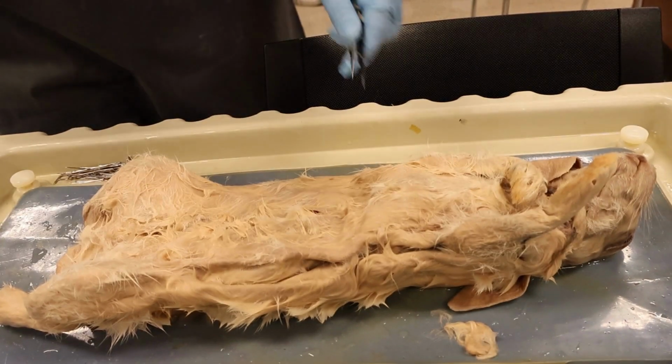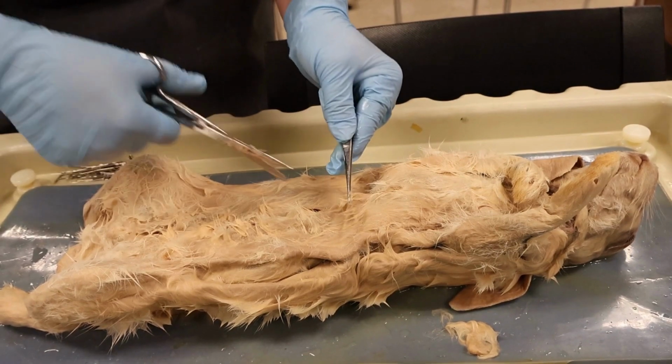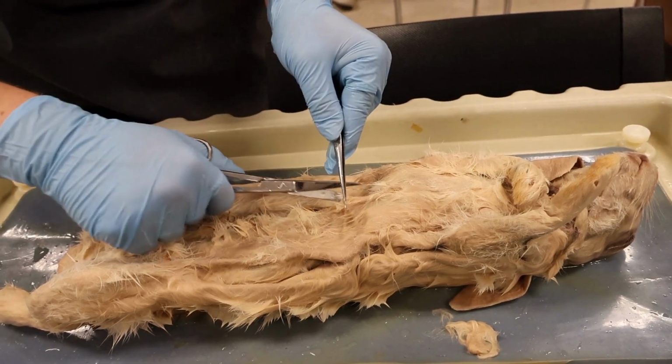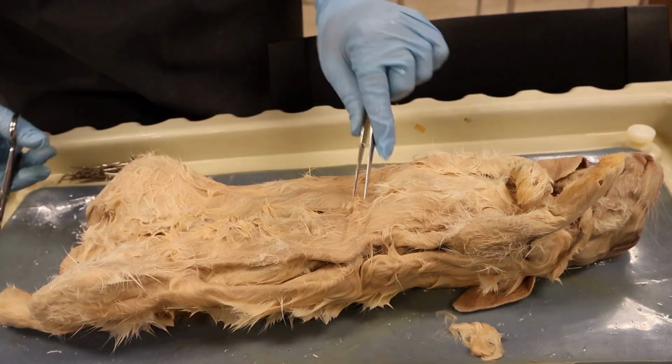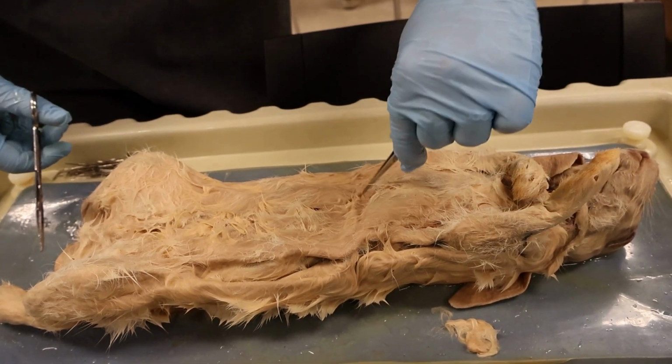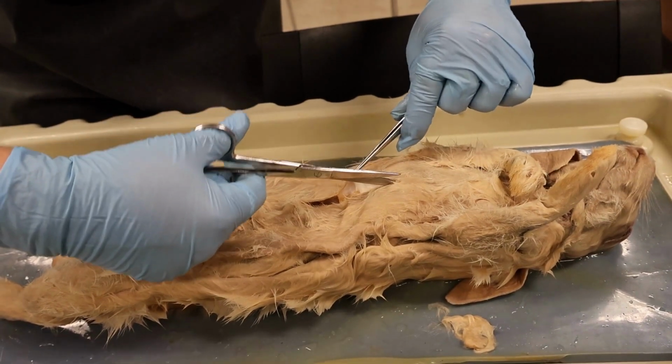Okay, so in the first clip we did discuss the integumentary system as well as some of the adaptations involved in this body system. I wanted to touch on this a little more clearly and concisely, as there was some background noise from other groups doing their videos. So in the second clip, while Emily cuts through the hair and epidermis layer of the rabbit, I wanted to discuss this. The integumentary system involves the skin and the hair of a rabbit.